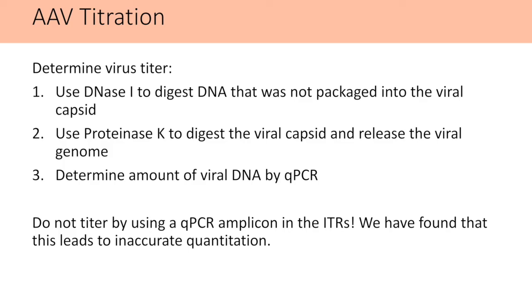It's very important that the qPCR amplicon is validated and is not within the ITRs. We have found that trying to qPCR off of the ITRs leads to inaccurate quantitation.